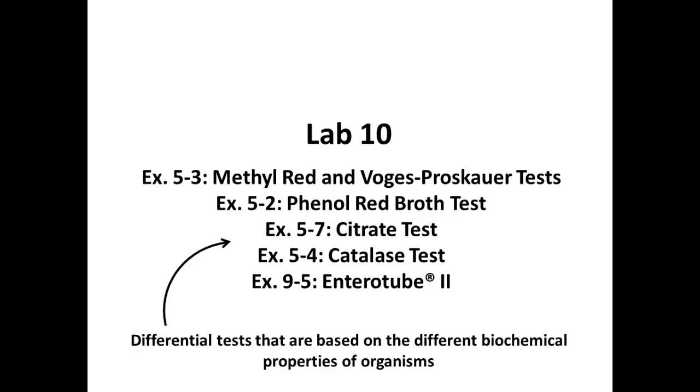So for that particular grouping of organisms, it would help you differentiate which one you got. So these are all differential tests, right, where we can differentiate one aspect from another, one group from another, and based on what they can do, mostly biochemically. Can they ferment? Right? Can they utilize different sources?